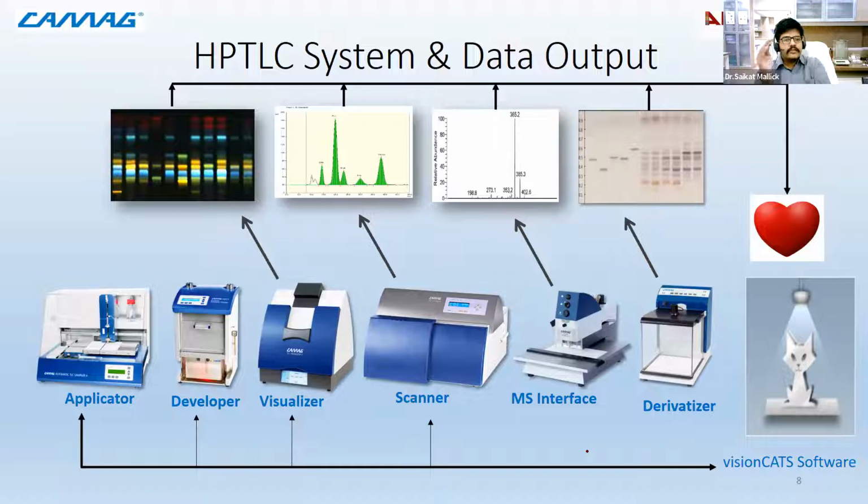And then we move further with the scanner part, which is the place where you get the chromatograms. These chromatograms are directly related to the peaks which you are getting. Here you have some bands. These bands are getting converted to peaks, and those peaks can be correlated with known concentrations to do quantitative estimations. Also, it has functions like spectral scanning, which is the absorption maxima. So the instrument records the absorption maxima at each and every wavelength, where you see the chromatogram, that is, the peaks.